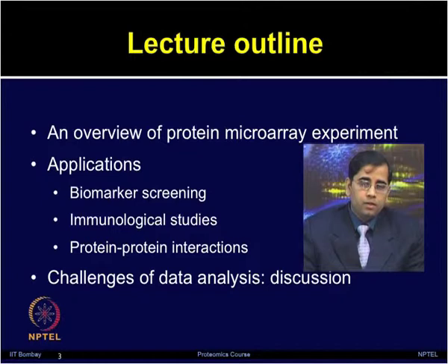Finally, we will touch upon the challenges of analyzing the microarray data. Regardless of whether you are performing an experiment to identify protein interactors or looking for new biomarkers, the microarray experimental setup provides a very high throughput platform and generates data for thousands of features simultaneously. Therefore, analyzing such data becomes very challenging. So, these three points will be discussed today.